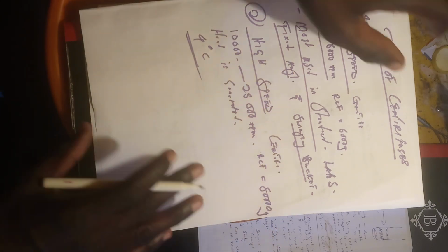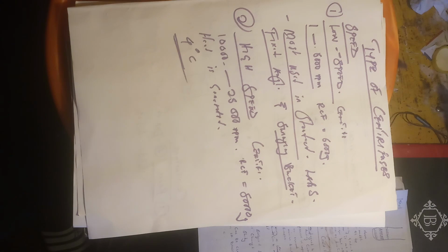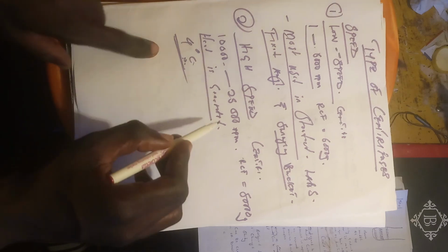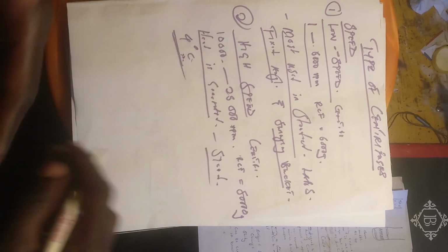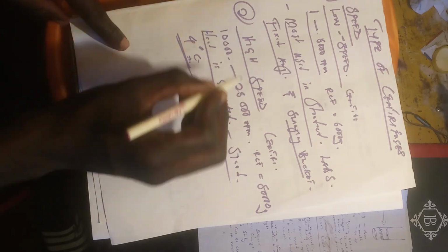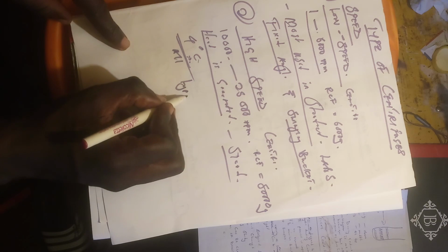To preserve the biological samples from getting damaged. If you're looking at proteins, you would even look at denaturation of proteins. So to prevent that, temperature is maintained at 4 degrees because heat is generated due to high speed. And last but not the least, all types of rotors can be used in high speed centrifuges.